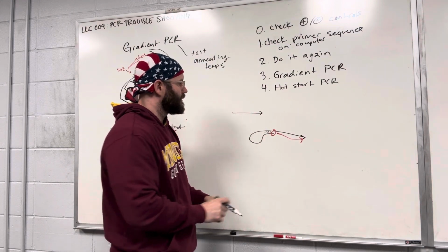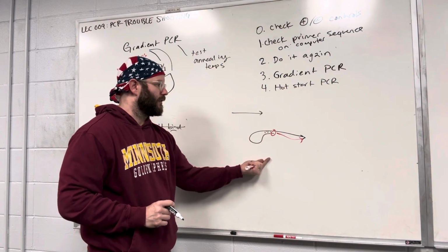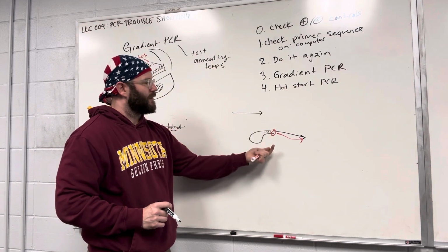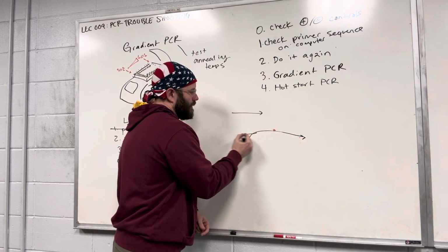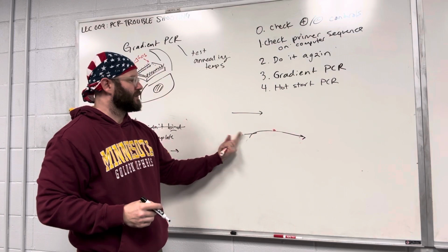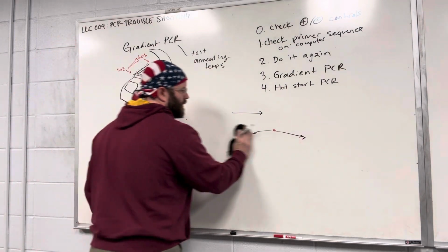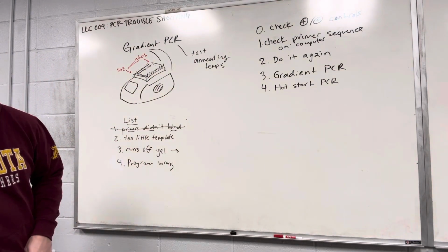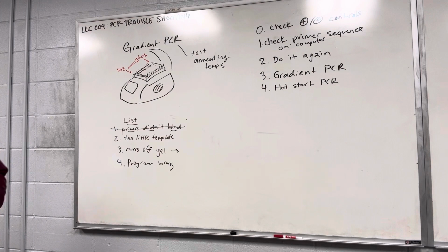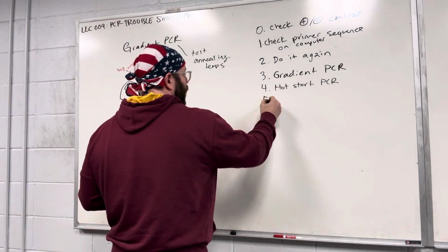Okay, so this is another common problem, these hairpins, that the hot start also fixes, because if you don't add the polymerase until it's hot, when it's hot, the hairpin will be released. Okay, so this hot start is a really clever trick that's really easy to implement that usually fixes a lot of problems with PCRs. Okay.